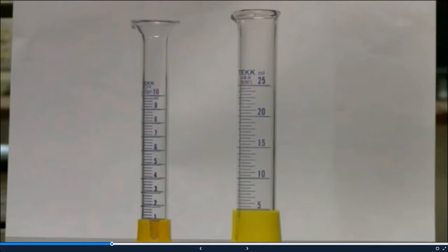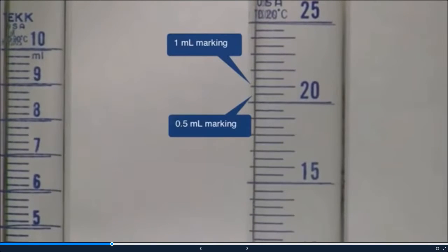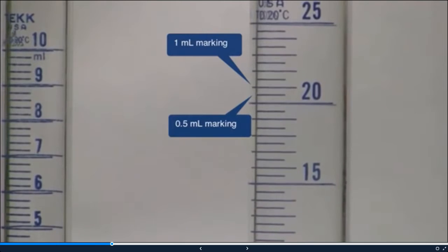If we look at our two graduated cylinders, we have a large one and a small one. Each one is different, so it's always important to pay attention to what type of graduated cylinder you have. For the large one on the right, the larger hashes are one milliliter markings and the smaller hashes are 0.5 milliliter markings. On the left, the larger lines are one milliliter markings but the smaller ones are 0.2 milliliter markings.